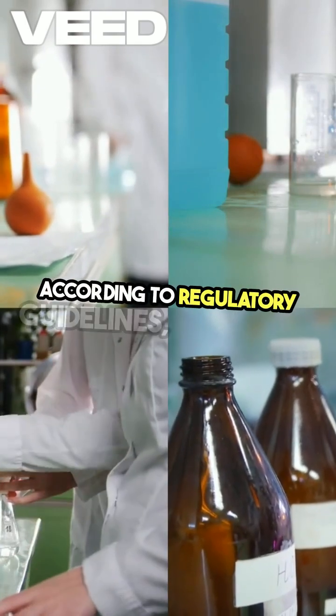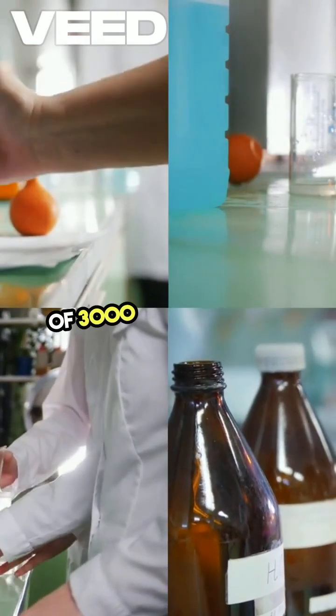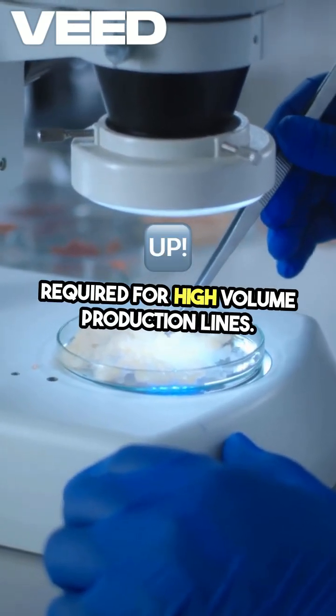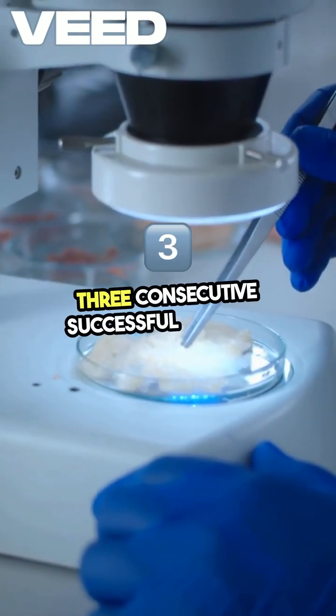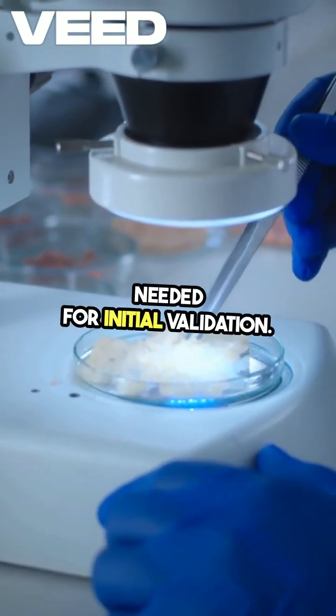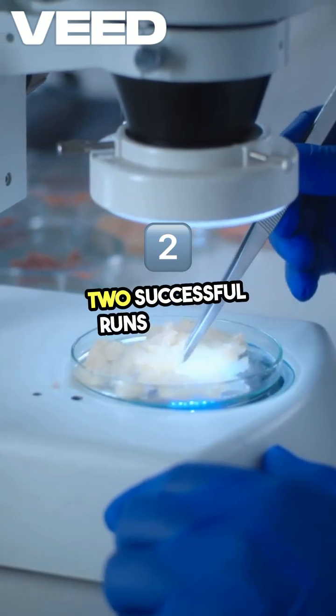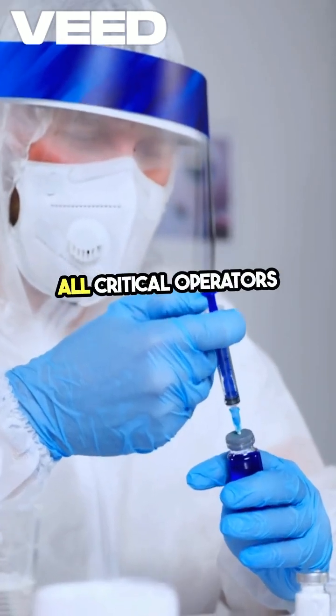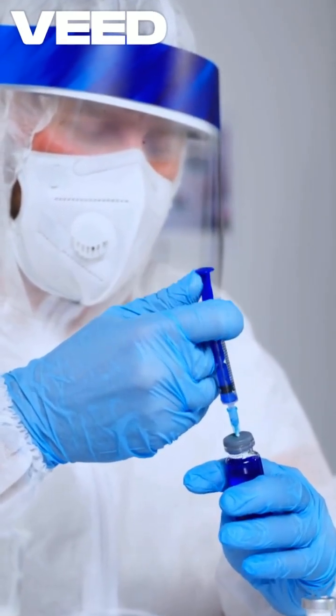According to regulatory guidelines, a minimum of 3,000 units per run is required for high-volume production lines. 3 consecutive successful runs are needed for initial validation. 2 successful runs per year are needed for requalification. All critical operators must be included in the runs.